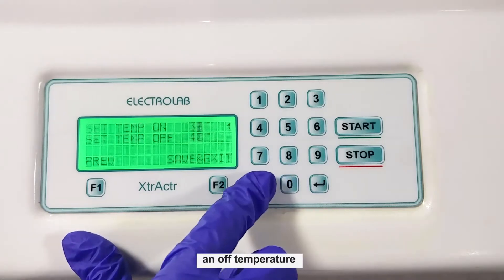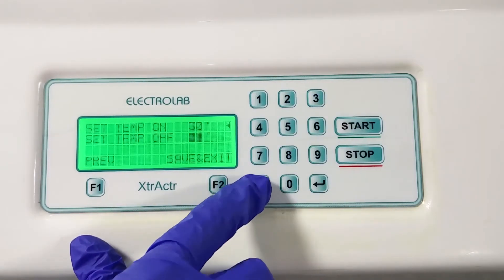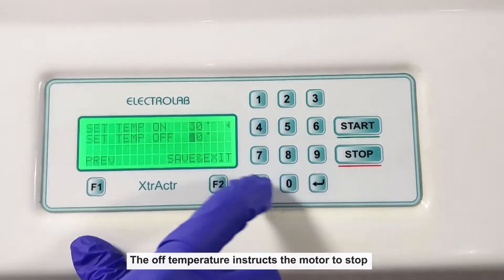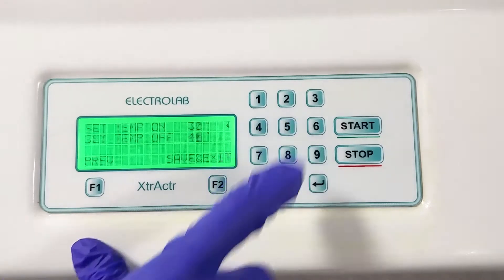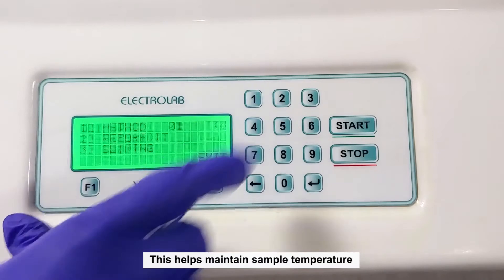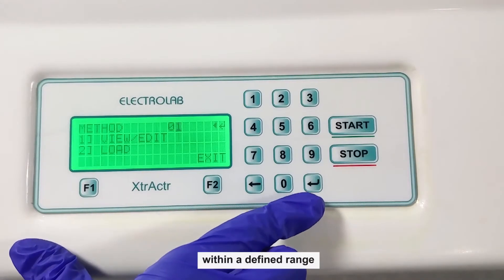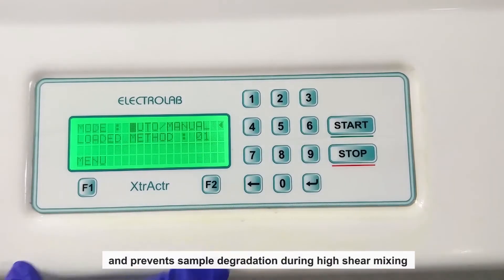In addition, an off-temperature and an on-temperature have to be stated. The off-temperature instructs the motor to stop, whereas the on-temperature tells the motor to restart. The off-temperature should always be set higher than the on-temperature. This helps maintain sample temperature within a defined range and prevents sample degradation during high shear mixing.